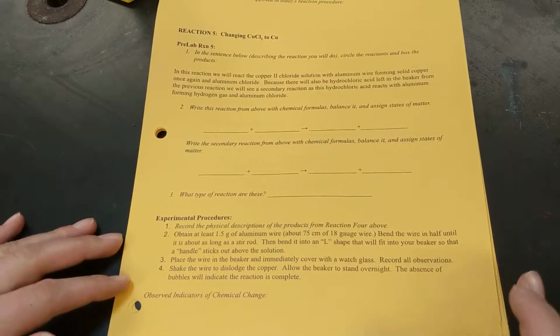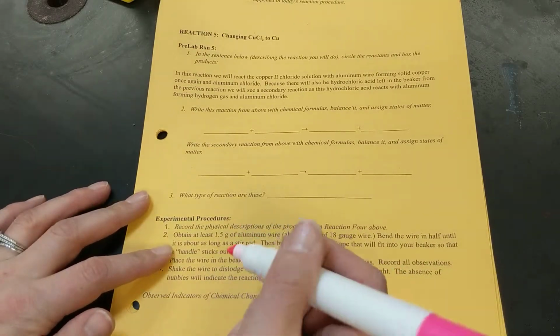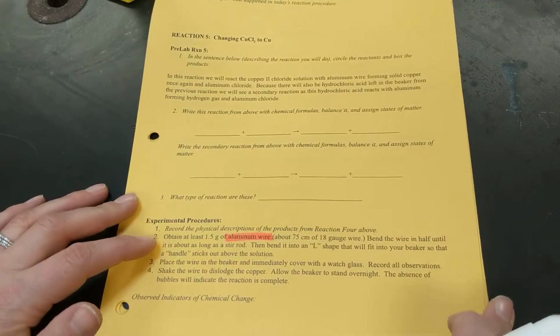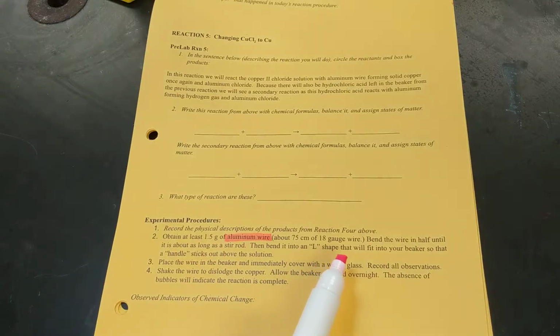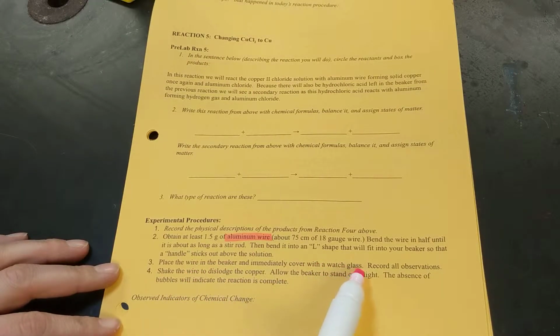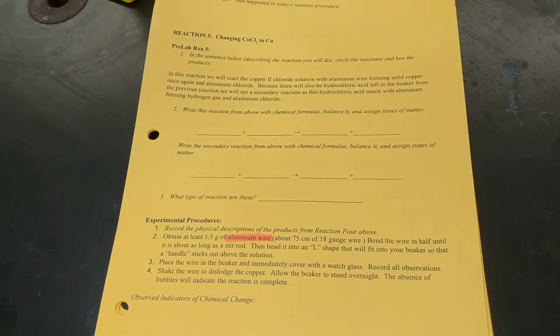For your experimental procedures, again, you'll record physical descriptions of your products, and it asks you to obtain 1.5 grams of aluminum wire. So we need aluminum wire. It says to bend the wire in half until it is as long as a stir rod, then bend into an L shape, and I'll show you that, so that way it'll fit into your beaker. It says to place the wire in the beaker and immediately cover with a watch glass and record all observations. Shake the wire to dislodge the copper, allow the beaker to stand overnight, and the absence of bubbles will indicate the reaction is complete. So the only material that we need for this is aluminum wire.